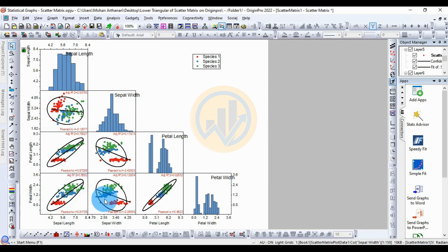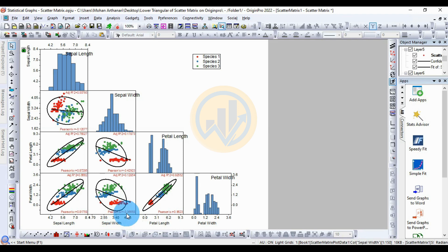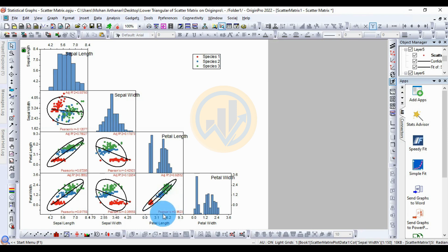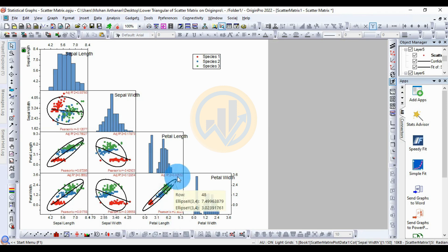For petal width and sepal width, there is a negative correlation — the Pearson value is -0.3668 and the adjusted r-square is 0.12854. For petal width and petal length, this is a very highly positive correlation — the Pearson r value is 0.9623 and the adjusted r-square is 0.92552.